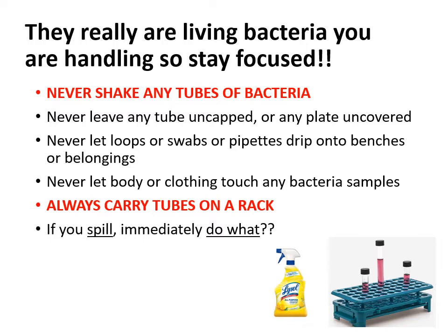Then you want to wipe it up nice and clean. You then want to make sure that when you dispose of those paper towels, you're putting them in the biohazard container. And what else do you have to get rid of? Your gloves that you are wearing, because they could have gotten contaminated now as well. So make sure to throw out those gloves in the biohazard pail and then put on a fresh pair.